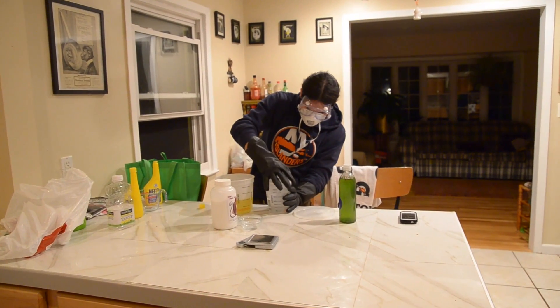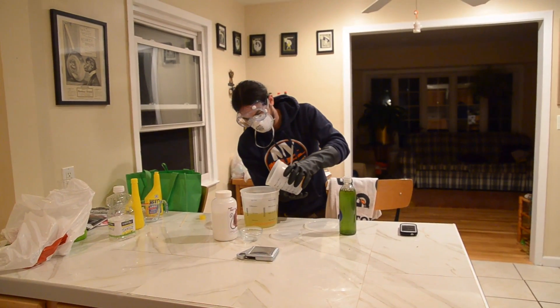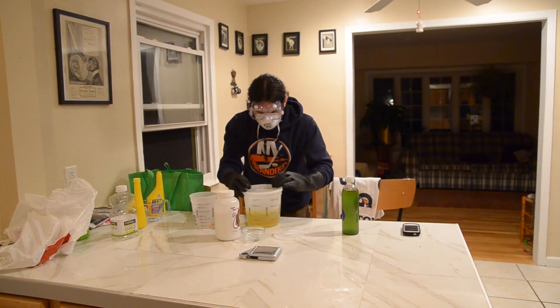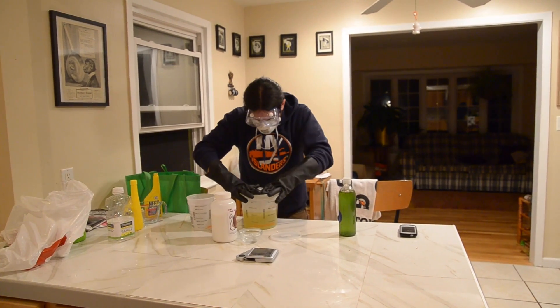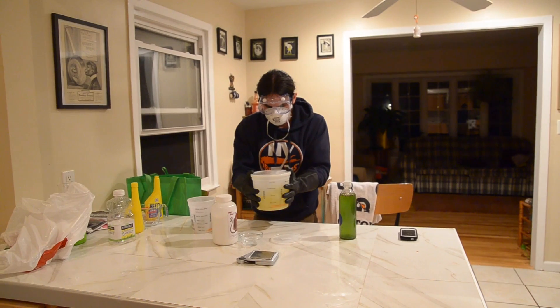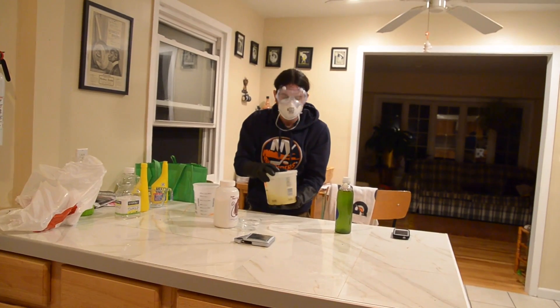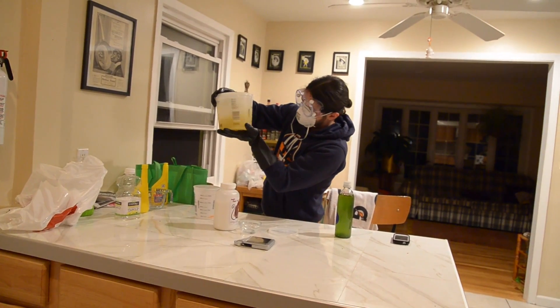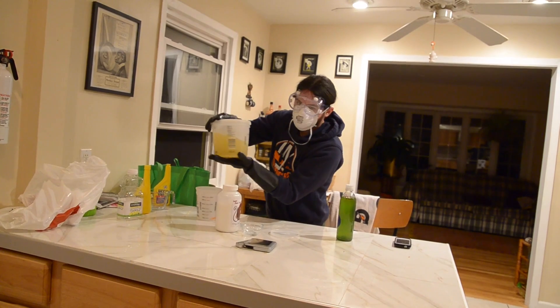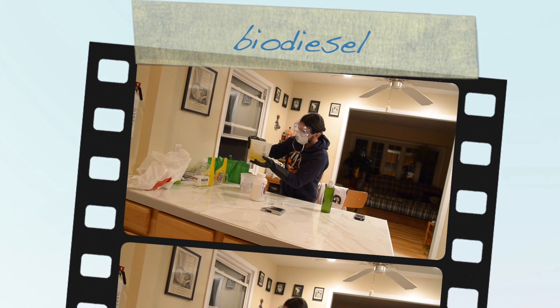I'm going to add our methoxide solution to the oil. Cap the oil and just give it a good swirl. The oil will start to get a little murky. After shaking it for about 15 minutes, I'm going to let it settle. Then we're going to look for the separation of the glycerin, which should fall to the bottom, leaving the biodiesel on the top.